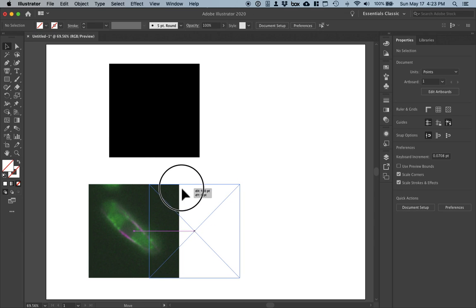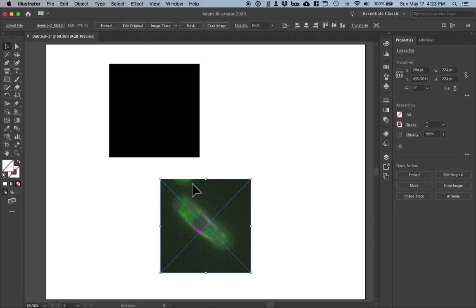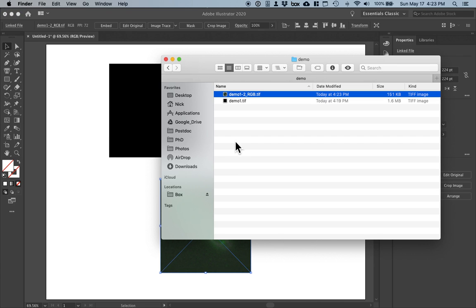And there are other ways to go about doing this. You can flatten, you can make it an 8-bit, and there are benefits to doing things different ways. I'm just showing you the way that I do it, of course. I think the most important thing is that you leave the 16-bit original file alone. That way you can always come back to it.